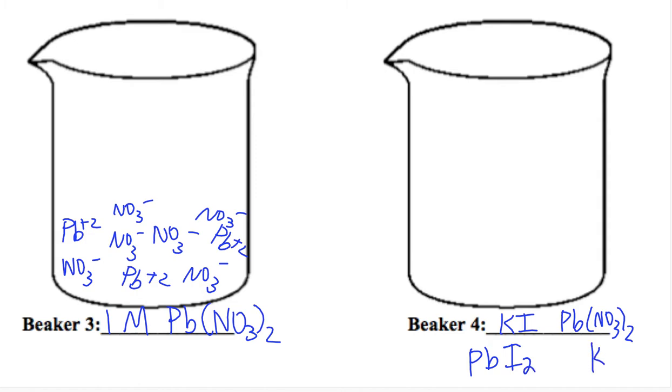And what about lead iodide? What's special about it? It's a solid. So, you think I'm going to form a precipitate when I mix these? Me too. Otherwise, my faith in chemistry will be ruined. Here we go.